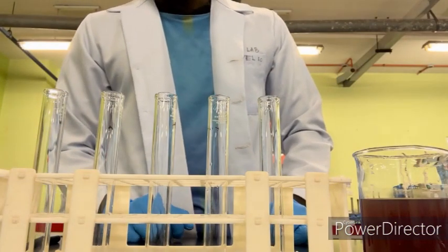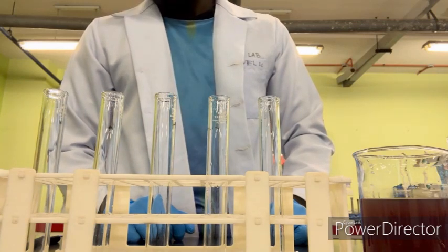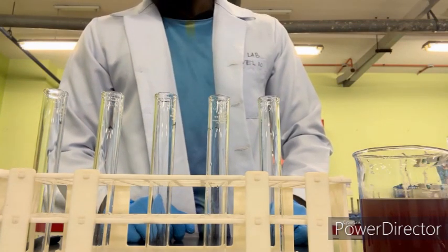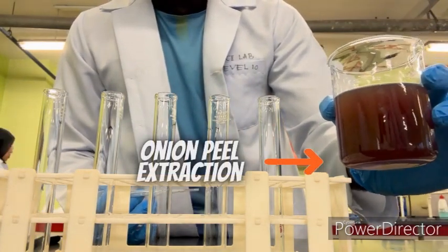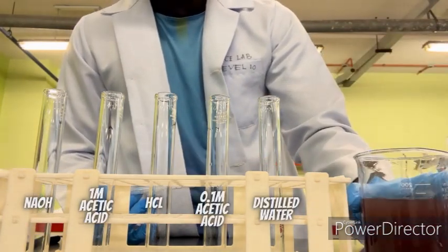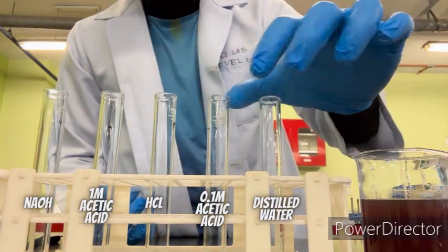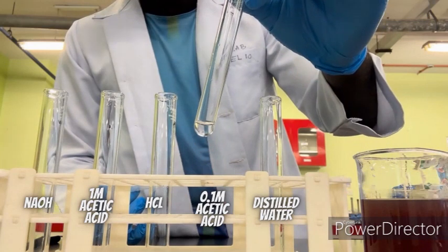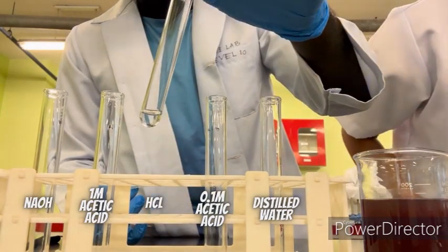By doing colorimetric experiment to determine the concentration of the solution through comparing the color changes of the solution. So our onion peel extraction, and also we already have the solution here. This one is a distilled water, 0.1 acetic acid. This one is HCl.